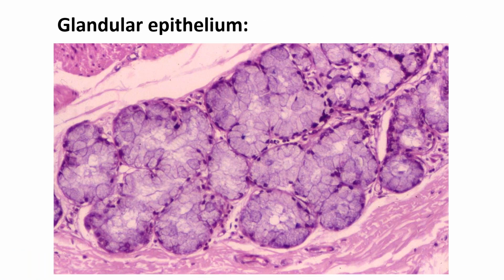Now, I also want to just briefly mention glandular epithelium. So the goblet cell was an example of a unicellular exocrine gland. And here, what we see is a multicellular exocrine gland. And these are mucus secreting, and they're delightful, okay? And so I can identify these because we have the flattened nucleus at the base, and we have the lighter staining mucus up here.